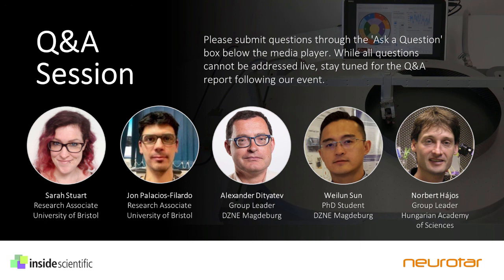Regarding the motion artifacts, I would recommend having a very good reference electrode, which is stable upon movement. In addition, if the mouse touches any metal lever or electrically conductive metal, you might expect to see a small artifact. These artifacts are easy to remove because they have a very characteristic electrophysiological signature.